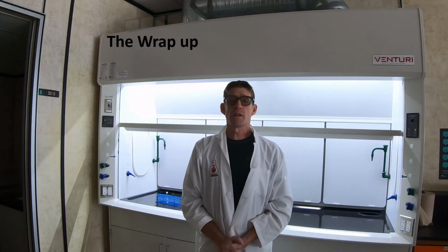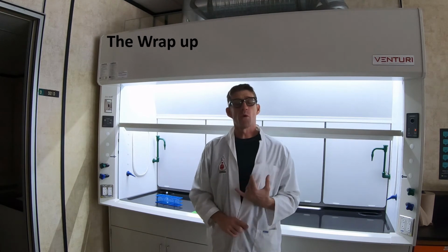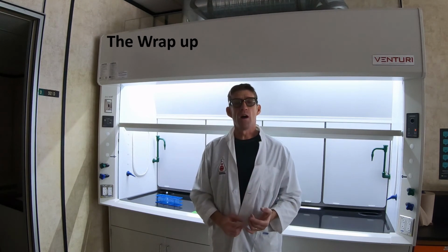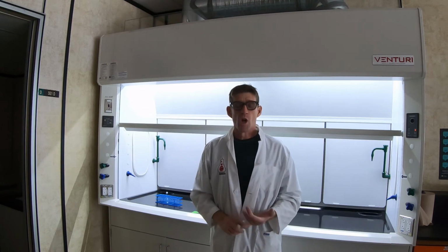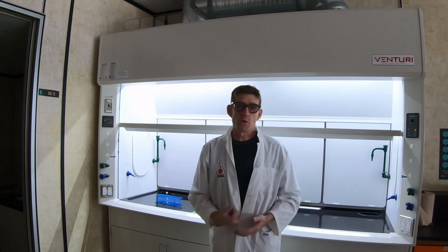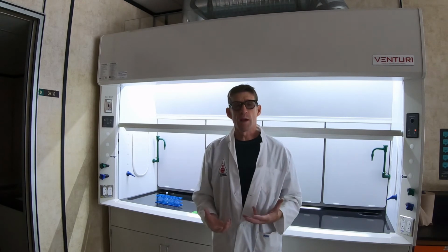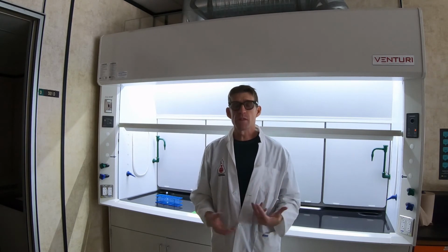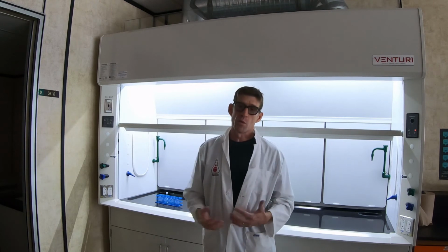A couple points of clarification. First of all, make sure in your reports you make mention of some of the small changes that we did in the experiment, outside the experimental. One would have been we used a thermal well. That's new to most everyone. I would encourage you to include a diagram of the setup. Anytime you use an elaborate setup of glassware that you haven't seen before, it's always a good idea to include a diagram, including the thermal well indication.